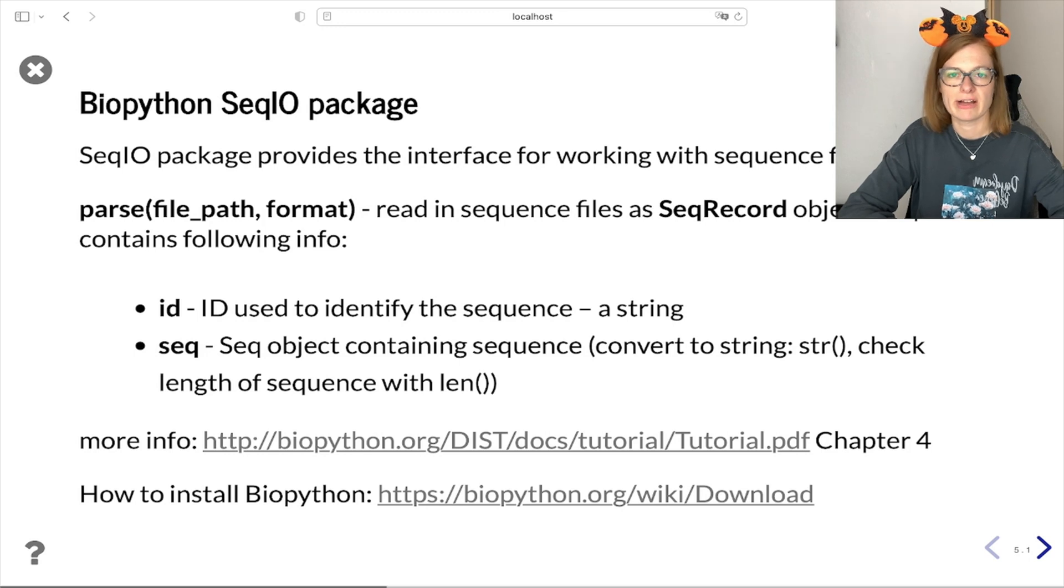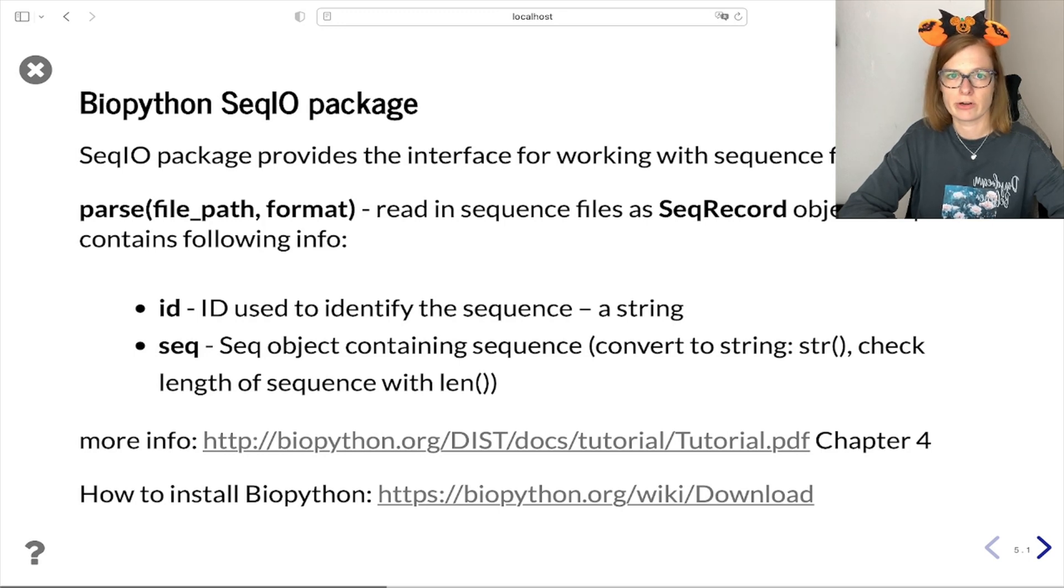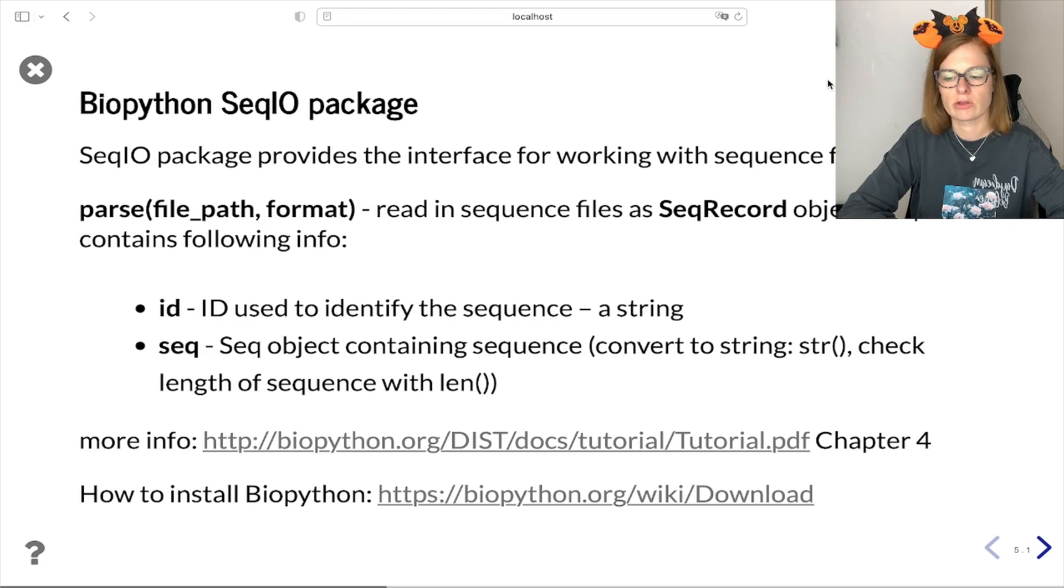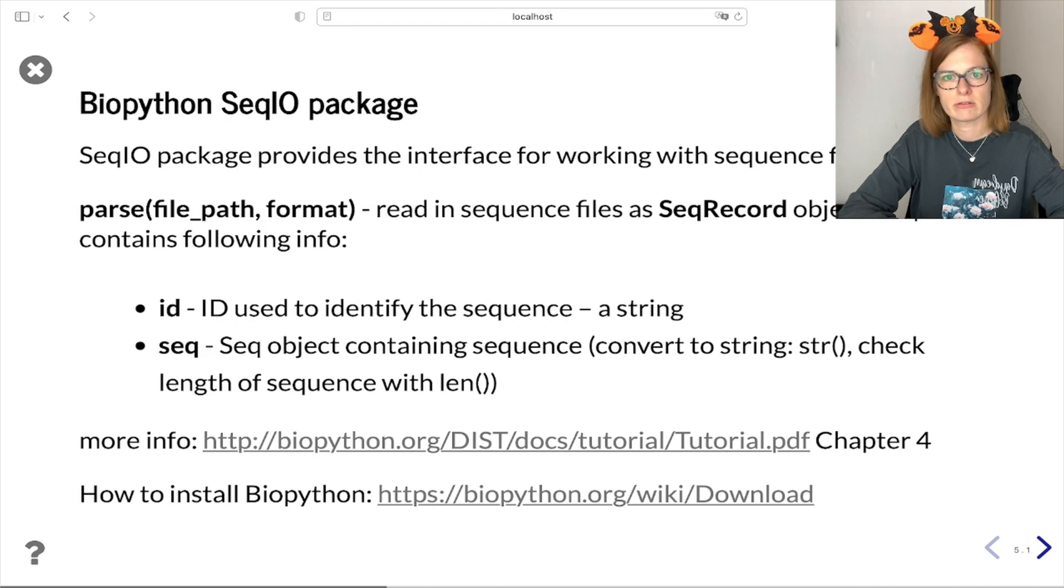Biopython provides a SeqIO package for working with sequence files. For reading our FASTA file we can use the parse function which takes file path and format of the file as input and returns SeqRecord as output.